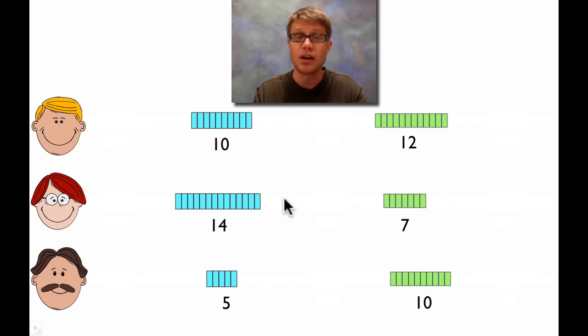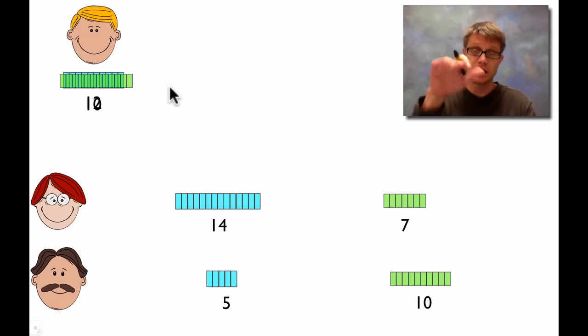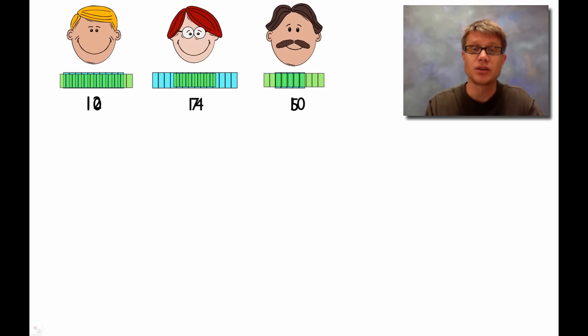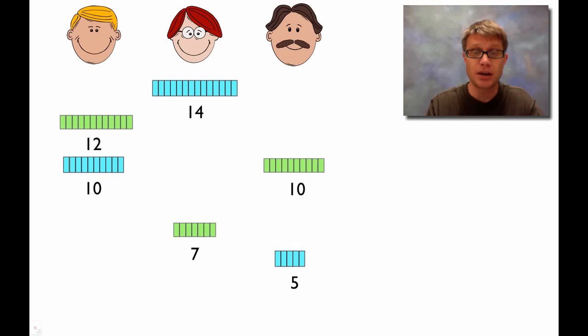So how does that work? Basically, I'll take the DNA and I'll put them in a little well, and so we're looking down on this, and so this is an agarose gel. I could put Mrs. Red's and then Mr. Mustache's. I could put those all in. Basically, I would then turn on the voltage. So there's going to be a positive charge here, negative charge up here. DNA is a negative charge, and so it's going to be pulled towards the positive. And so what's going to happen is those little fragments of DNA are going to migrate.